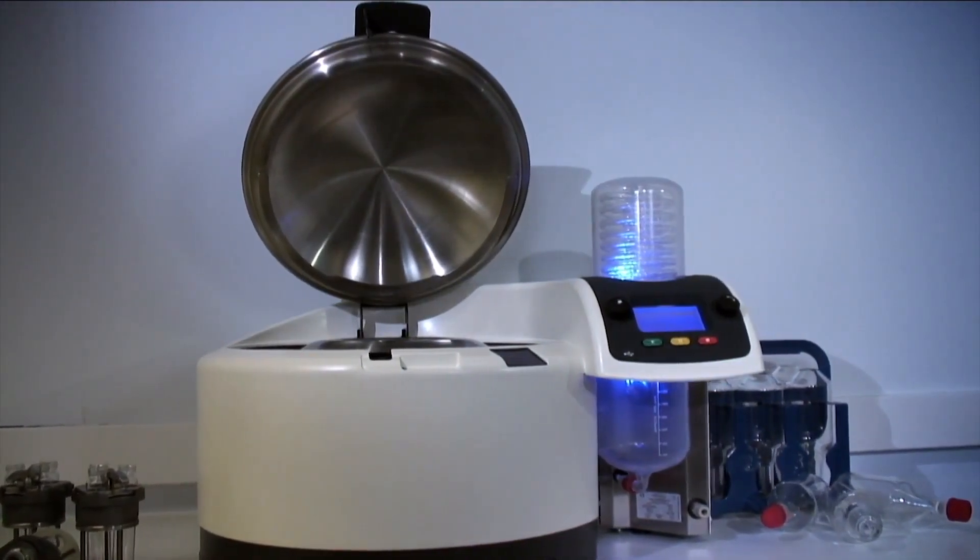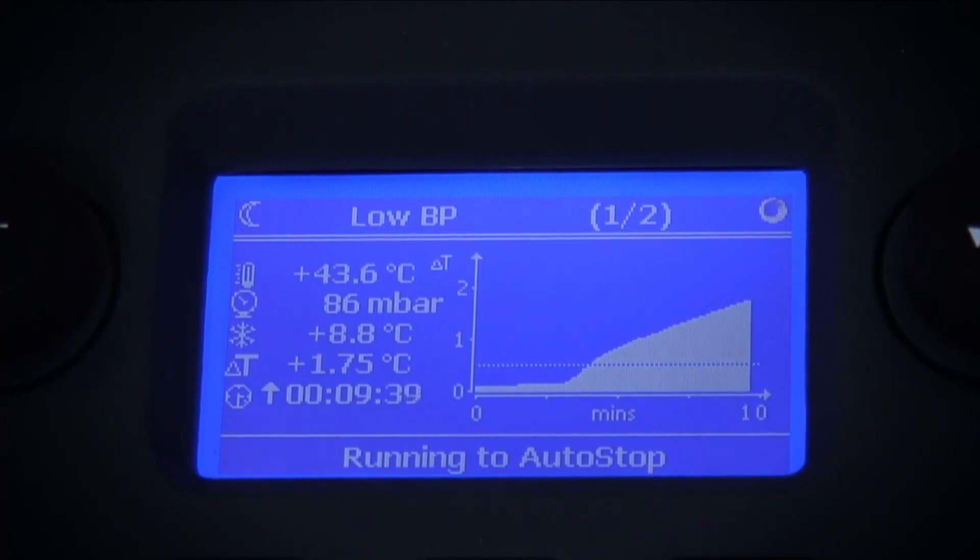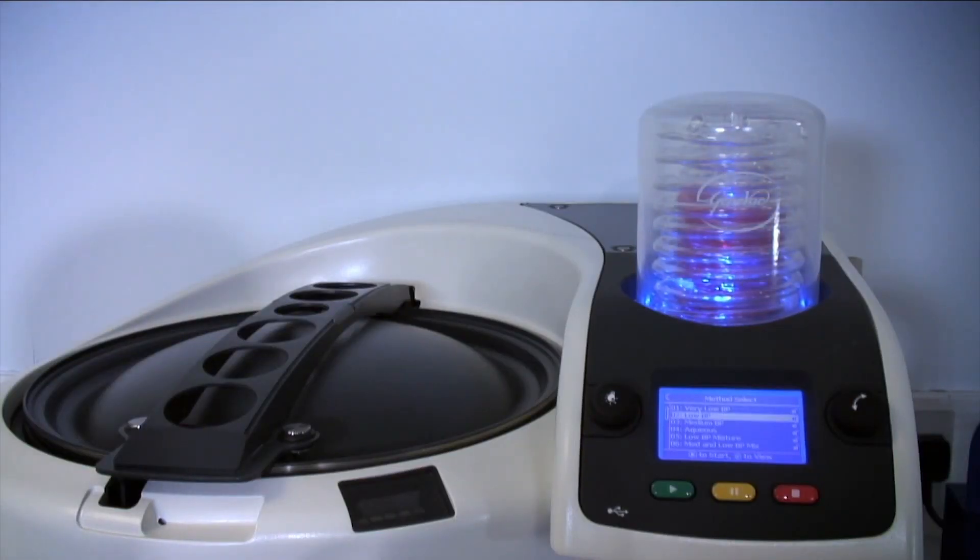The system will evaporate the samples automatically, leaving the operator free to do other things. Dry pure, pressure and temperature are all accurately controlled by the system, stopping automatically when the samples are dry.